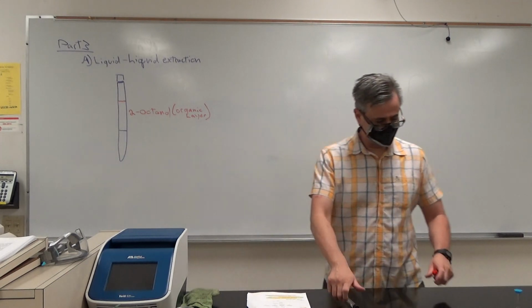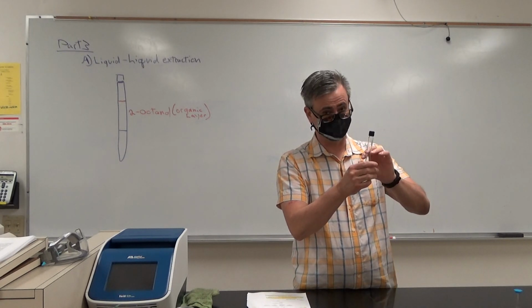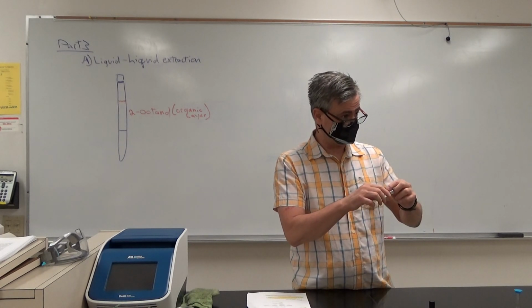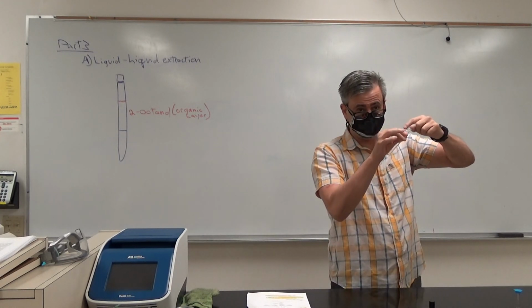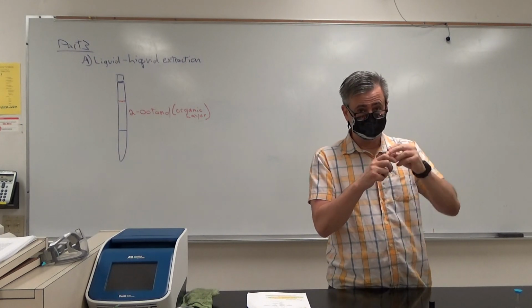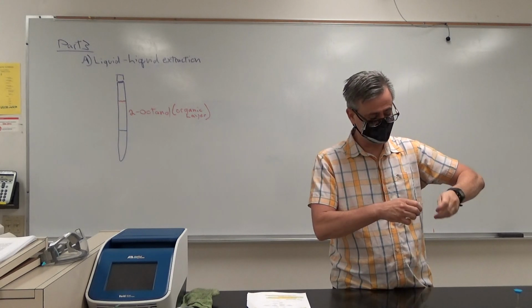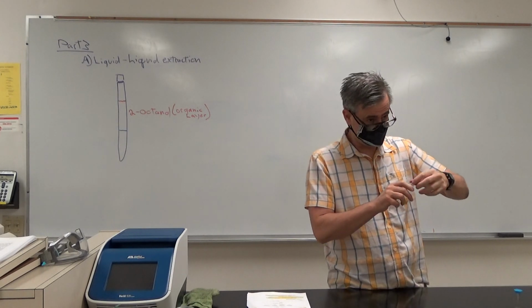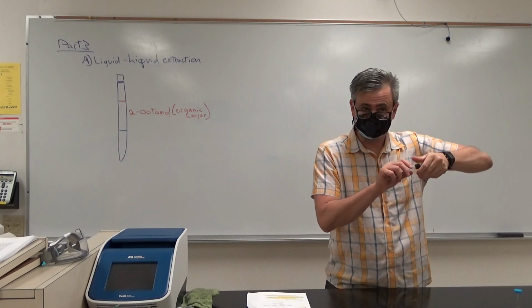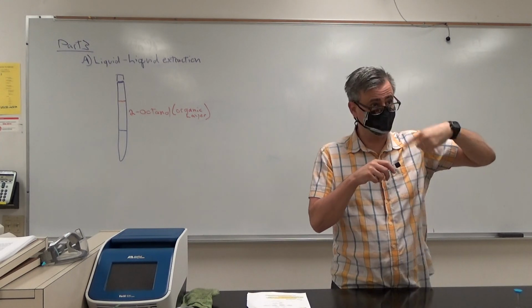All right, and so just like with Italian salad dressing, you've got two solutions that are immiscible in here. We're then going to put Teflon tape around these threads. Okay, Teflon tape, plumbers use it a lot for threads if you don't want them leaking. Then you just wrap it around, it tears right off, and if you're really being careful, put the Teflon tape on so that when you tighten the cap, it's going the same direction. It lays the tape down rather than undoes the tape.